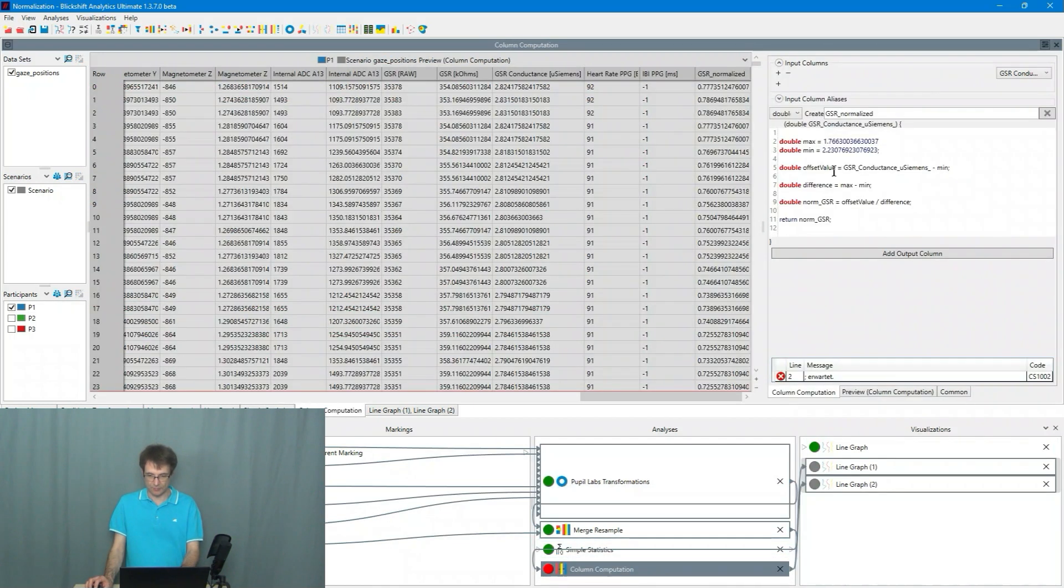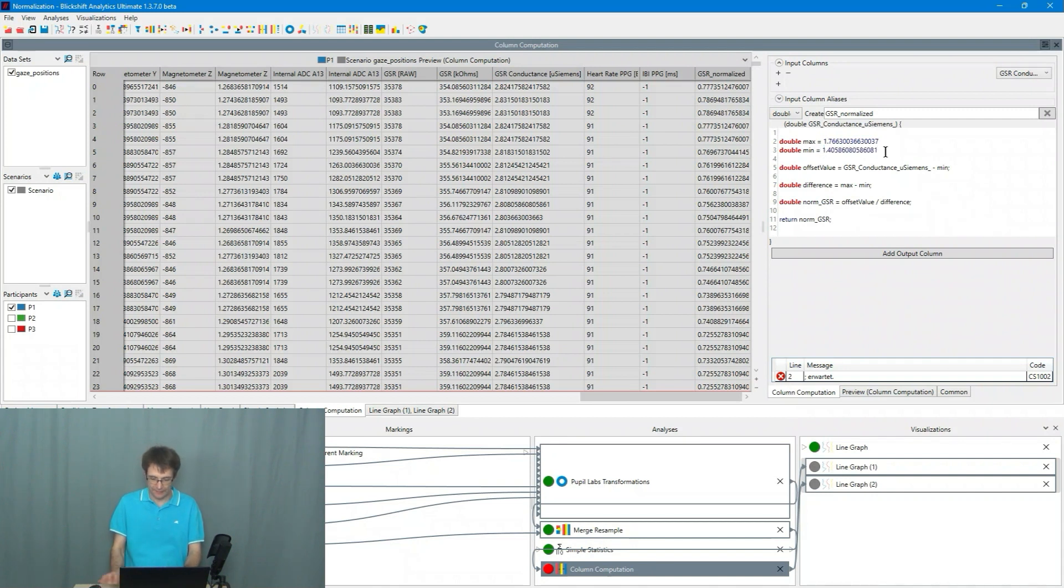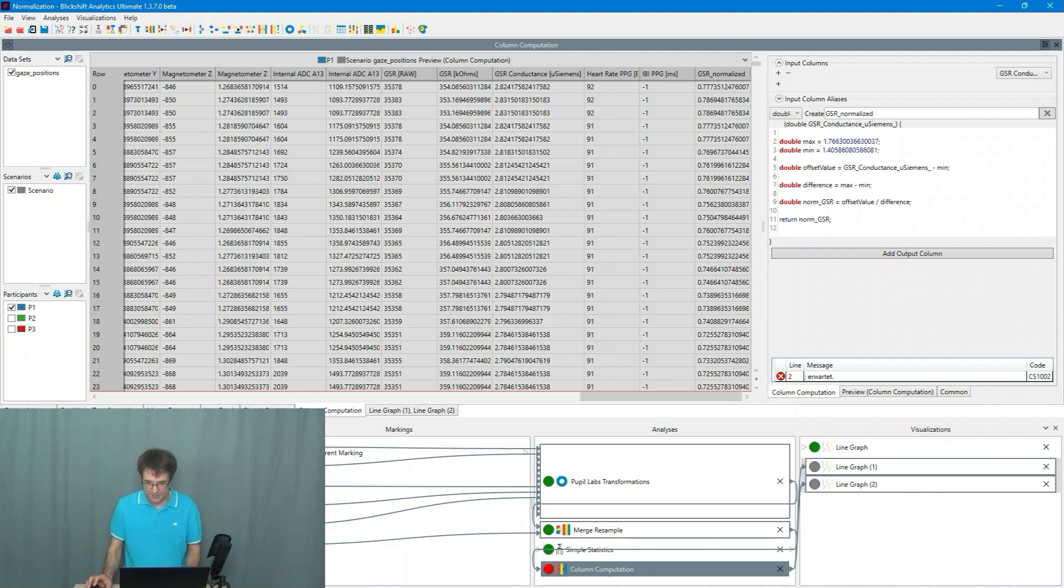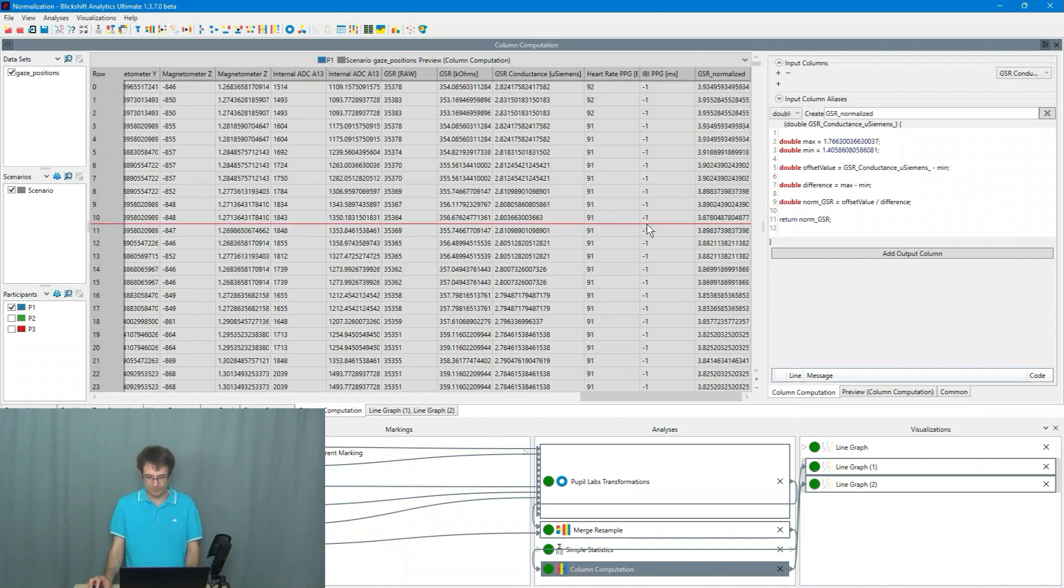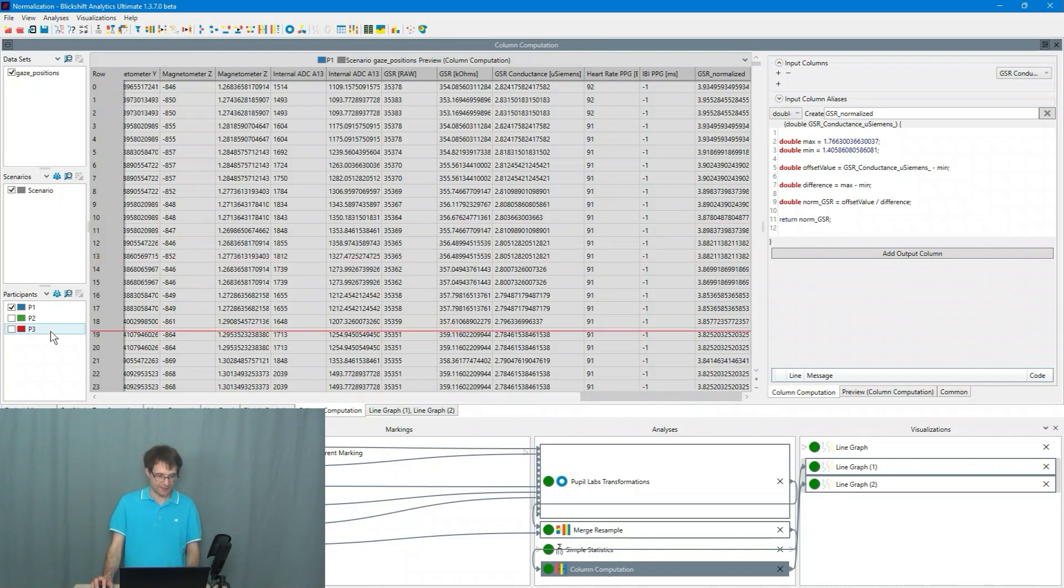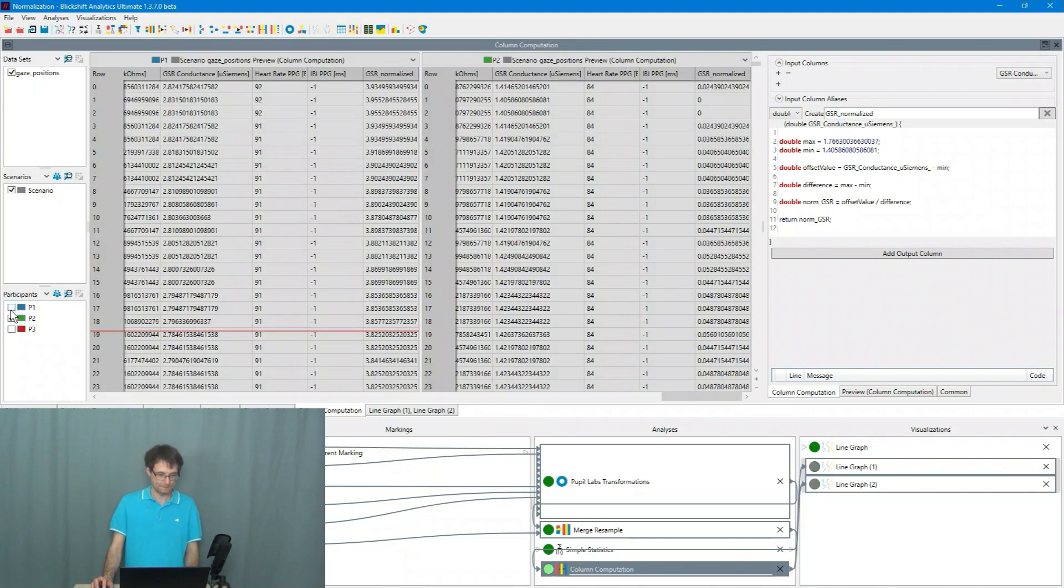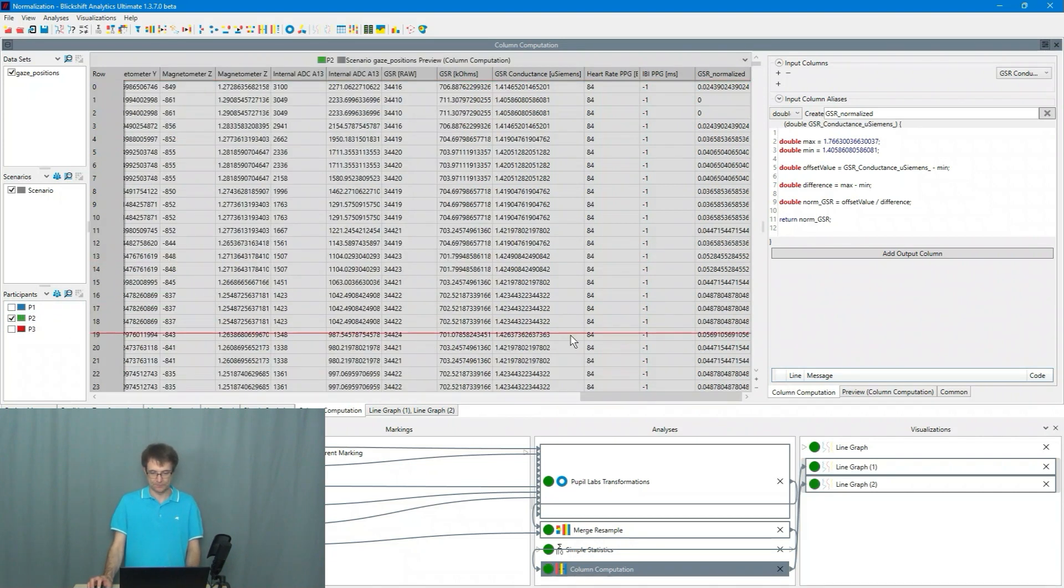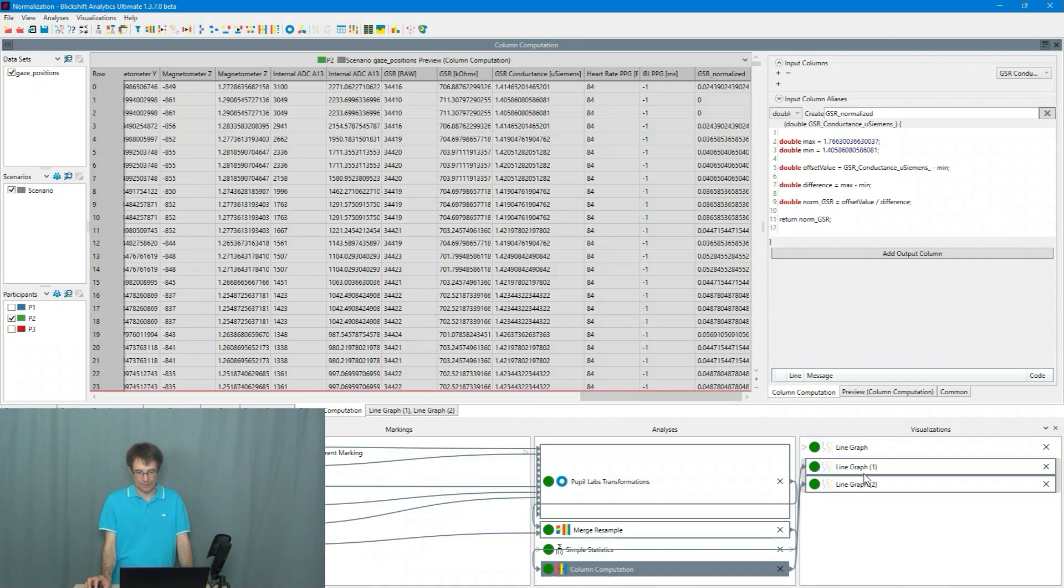I go to the simple statistics. I copy the minimum value. I go to the column computation. And here I delete the semicolon. So everything is fine. Now I have to select here P2.